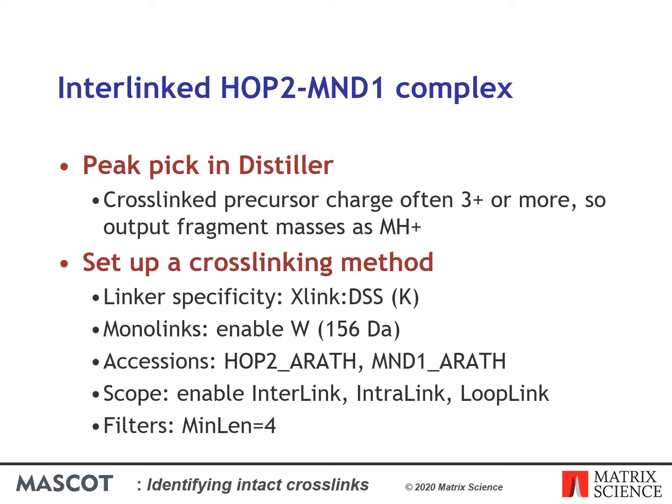The accessions in the cross-linking method act as selectors and instruct Mascot to choose only the listed proteins for cross-linking. The sequences are in SwissProt, HOP2-Arath and MND1-Arath, so we can just list them here and select SwissProt as the search database when the search is submitted.